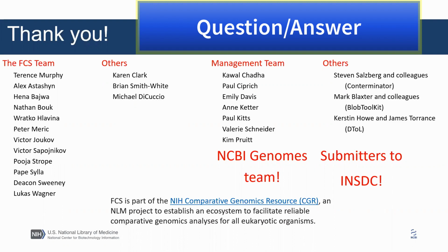But of course, as new data gets released, that might improve our ability to identify contaminants, like if they're clean genomes. So we also want to consider including additional genomes that get submitted to be in scope for the database in the future. Right, exactly, to keep the taxonomic scope up to date.